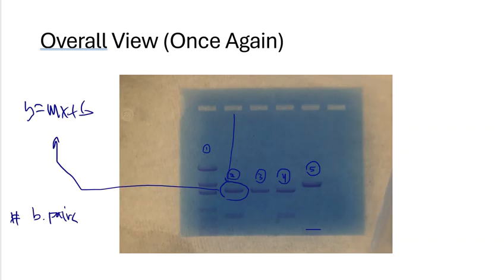So we can go one step further than what we did in our previous experiment together. Actually, a couple of steps further. We're looking at real bands that traditionally show up in electrophoresis. We are measuring distances because we didn't do that in the other one. We just compared colors. We're plotting a calibration curve based on the base pairs that we are using. So that's something different.